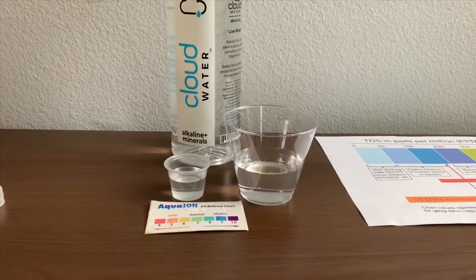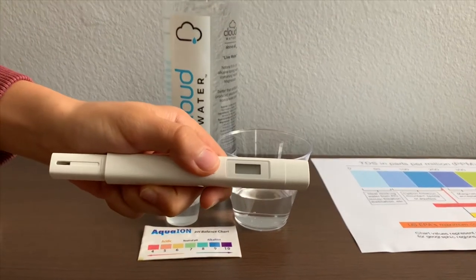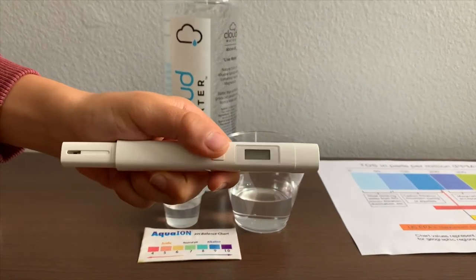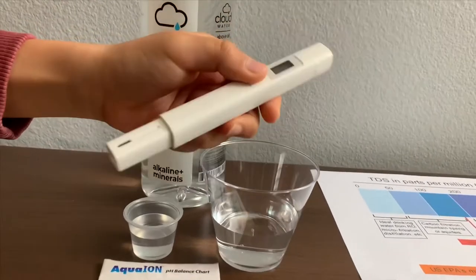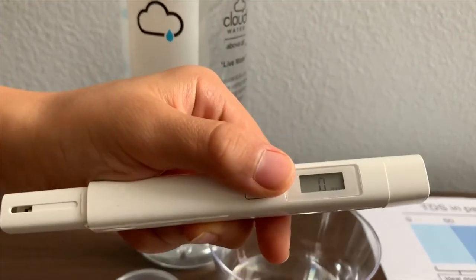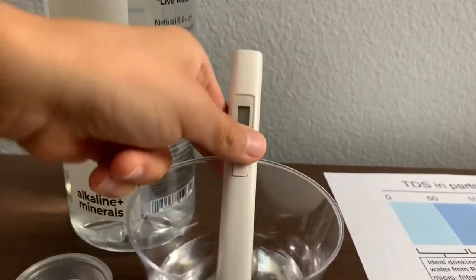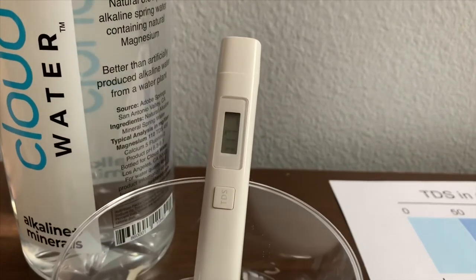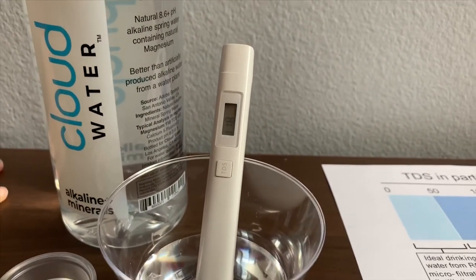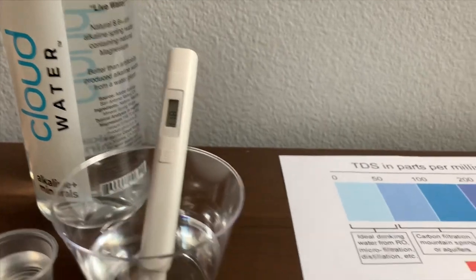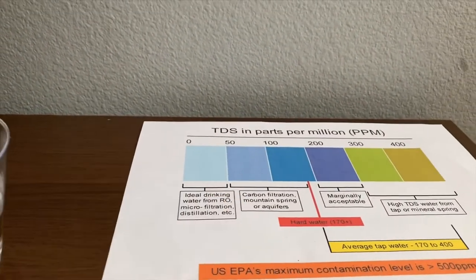First, let's test the TDS level. If you want to buy this TDS tester, check the link down below. Turn on the TDS tester, make sure it says zero, and put it in. 118. That is mountain spring water or aquifers.